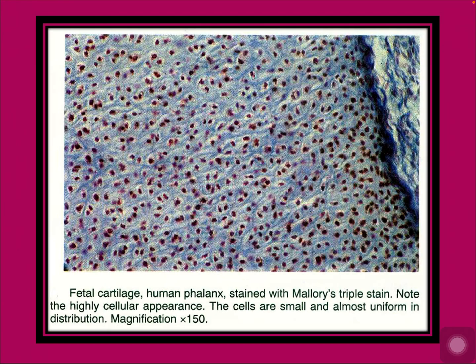Again, same fetal cartilage, but you should see this is another stain, Mallory's triple stain. All these pictures are present in Deepak's Atlas of Human Histology. All the MBBS students should have this atlas. It is a good atlas for histology.